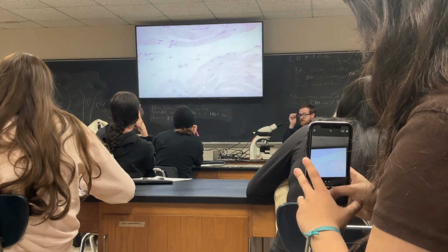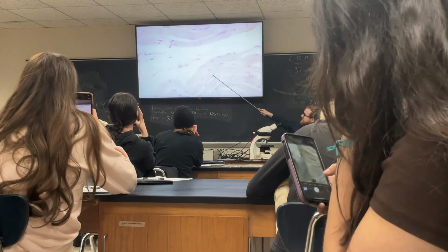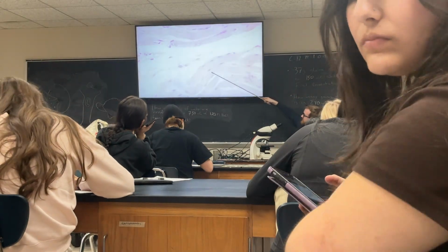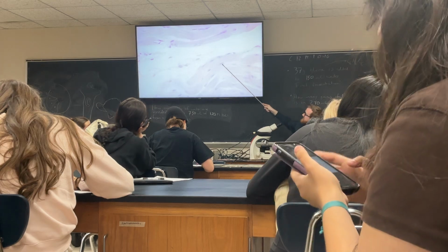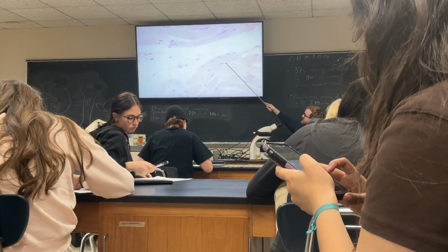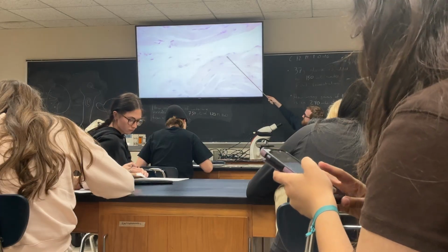See the difference? That nucleus is in this cell, but it's squished to the side of it. Same thing with all of these. That's in between, these are two different cells, so that space is not inside a cell. So that cell is squished to the side of maybe this one.